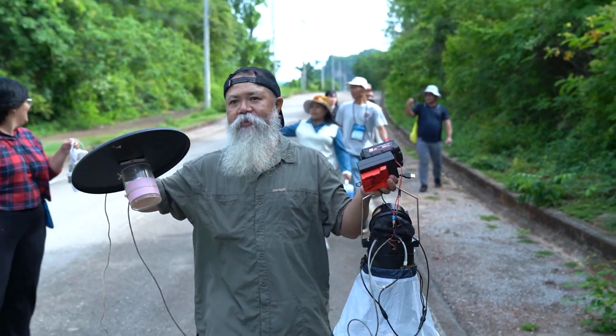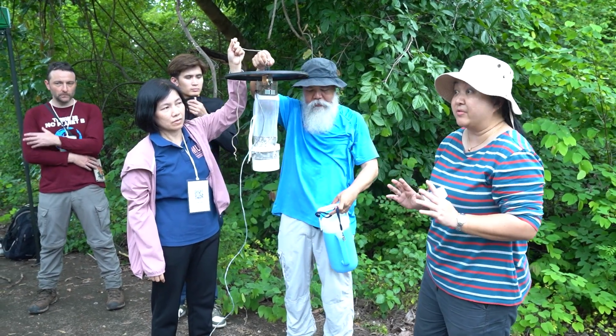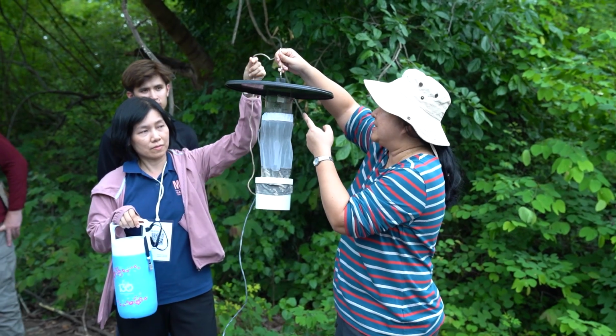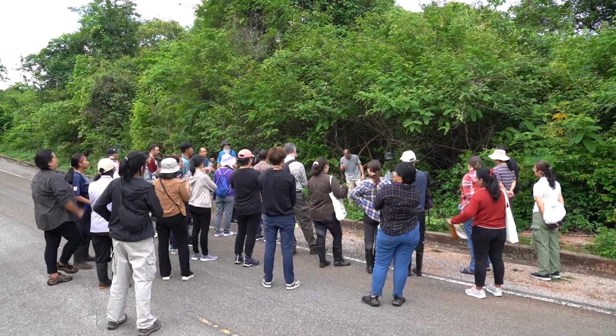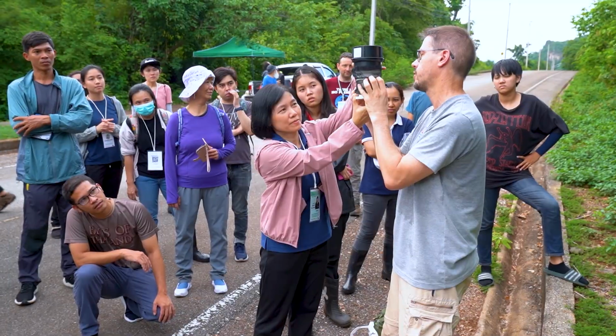Right now we are at the Department of Medical Entomology. We are part of the workshop on vector-borne disease. So here we have the experiment and demonstration of mosquito collection and some applications for research and also the surveillance system. This is for increasing new emerging diseases. So I think it is good for researchers and also for public health, which can prepare for the new emerging diseases that are coming to us. So I think it is useful and beneficial for the trainees.